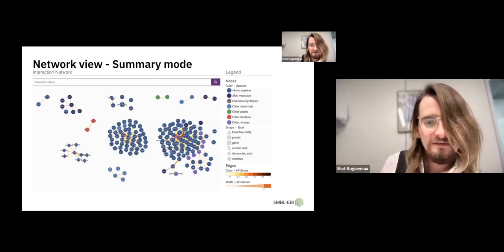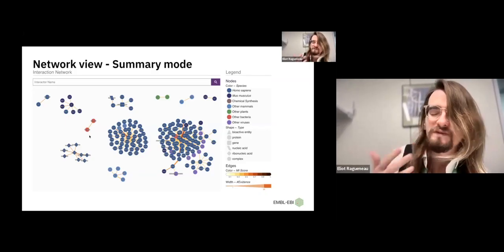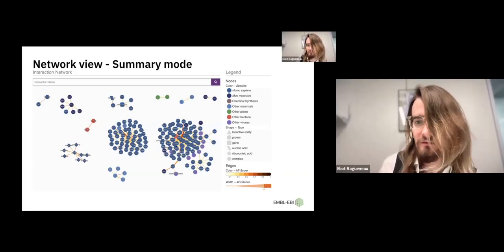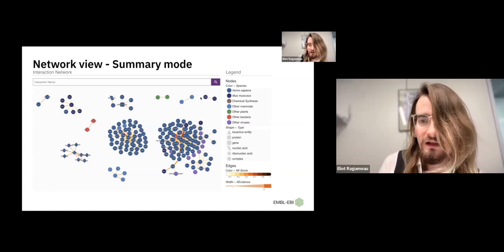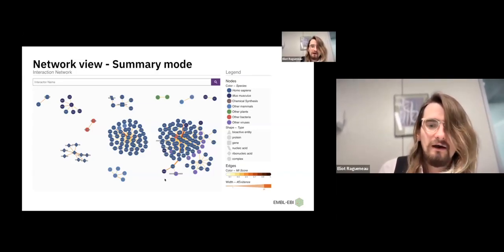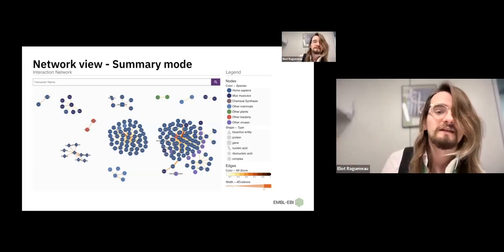This is Homo sapiens, and they represent the vast majority of nodes, as you saw just before, within IntAct. Then you've got Mus musculus, which is slightly darker, and then other mammals, which are in brighter blue. This is telling you information about the species, but then you also have information about the data type.